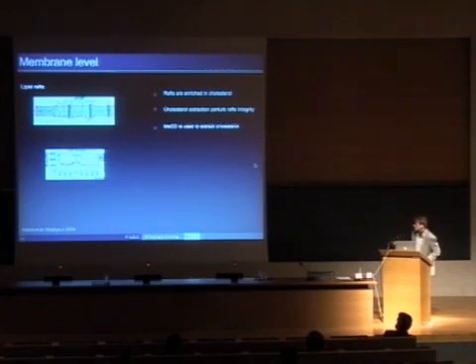And here, we've added this drug, destroyed this structure, and you see that you have a drop, and you don't see this difference anymore. And this is true at 1 pixel distance, 2 pixel distance, or 3 pixel distance.